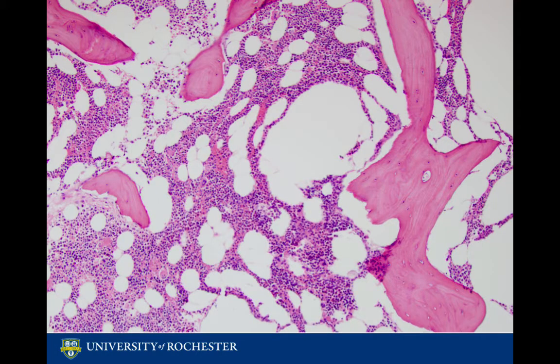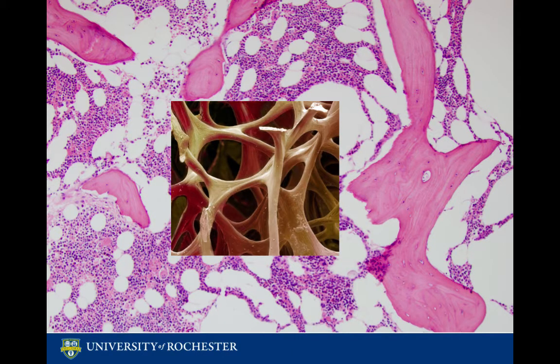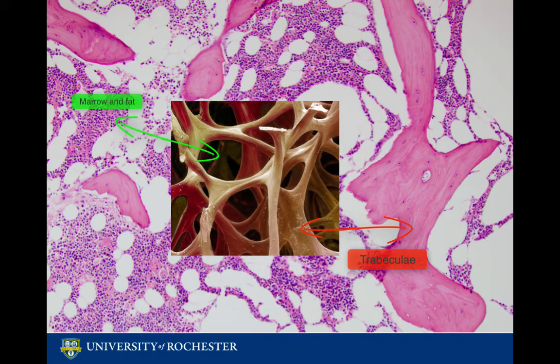The current 10x image shows the normal histology of spongy bone. We can tell this is spongy bone because of the presence of marrow and fat. Another key feature of spongy bone are these solid pink structures called trabeculae. The solid part — the part we would actually consider bone — are the trabeculae, and in between the trabeculae, those little pores are where bone marrow and fat cells are located.